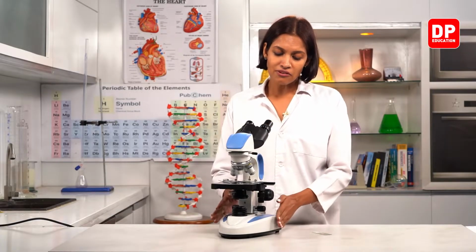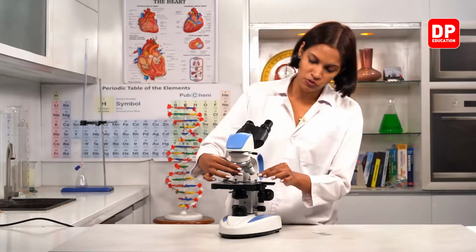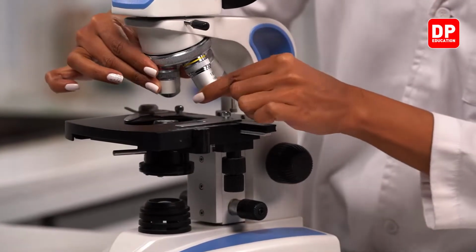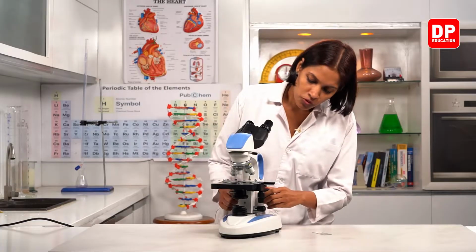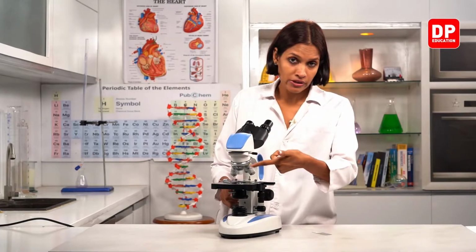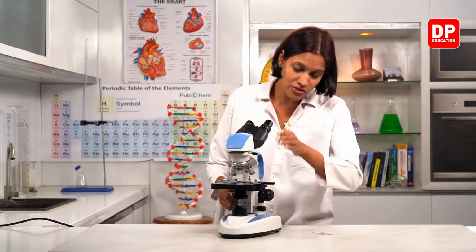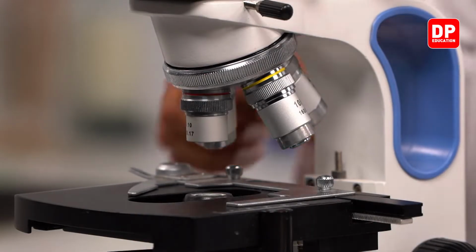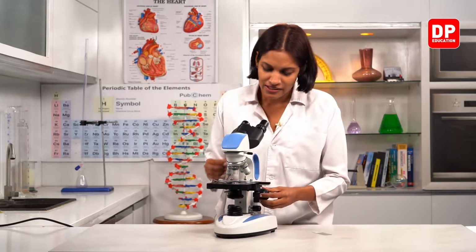Okay. Then what we have to do is bring the low power down. Low power. Now here it's already low power. Low power objective is down. So in order to move this low power up and down, we need to increase and decrease the distance between the stage and the objective. What do we have to use? We can use this coarse adjustment knob. Right? Okay.